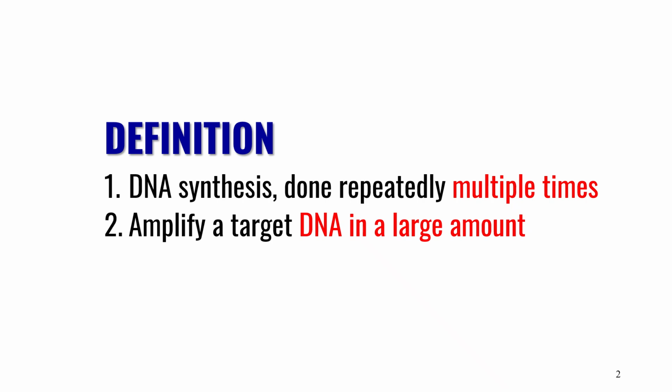Why and how DNA is amplified will be discussed in detail, but for now you should remember that one of the objectives of this technique is to increase the amount of target DNA so that the analytical techniques such as gel electrophoresis, DNA sequencing, or Southern blot analysis can be applied.